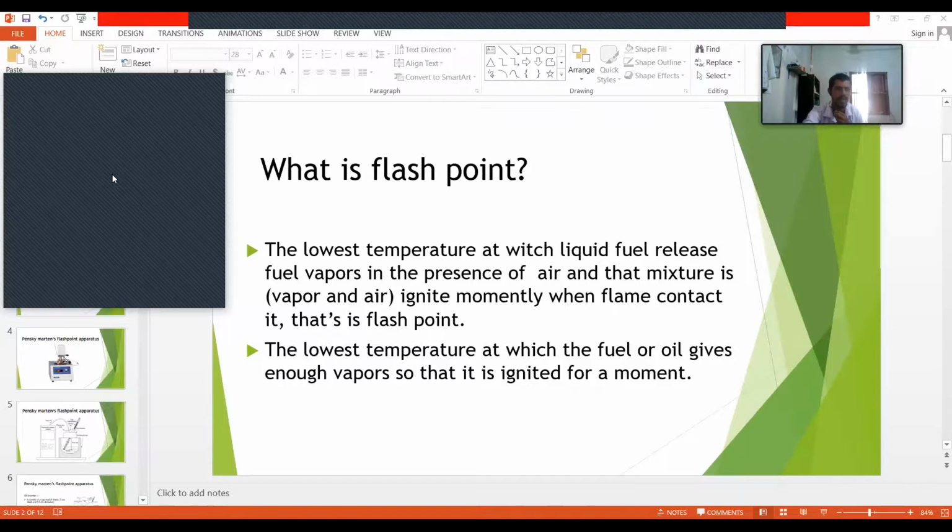Okay. Then Lakshan, do you hear? Yes, sir. Then Lakshan, what did we find as the flash point for the diesel fuel? 74. Okay. I think you also were there. You hear, but you forgot. That doesn't matter. You are near to the temperature anyway.